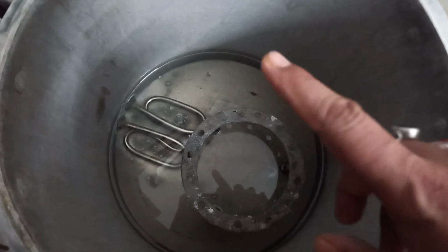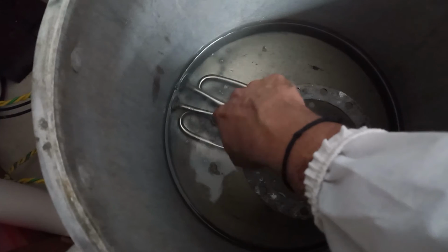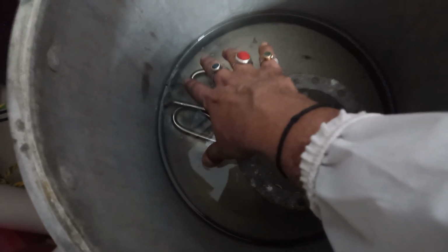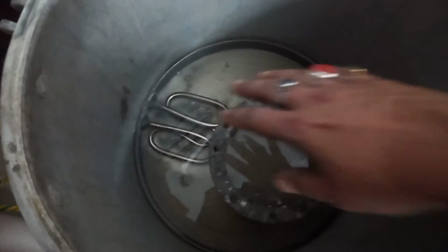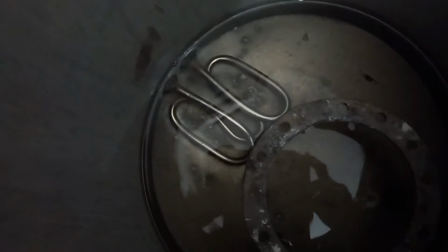And one thing you have to keep in mind is that you have to keep the water level in such a way that it covers the heater. The heater should not be exposed. If the heater is exposed, it will blow away. So keep the water at a level where the heater is covered, and no part of the heater is exposed above the water level. You have to keep that in mind.